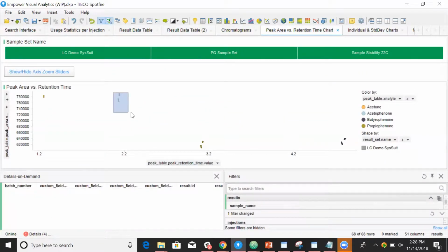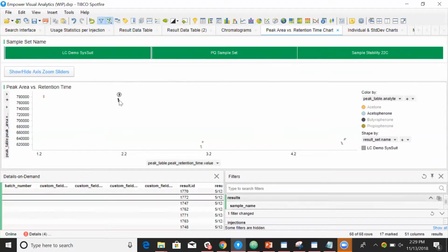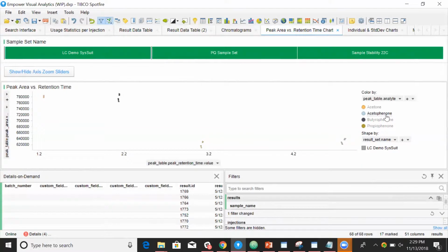We can see which results belong to which chromatogram, and can make selections here to display whatever we like. We can also organize by different metadata in order to improve the effectiveness of our visualization. Rearranging the chromatograms in a number of ways helps us compare different batches and different product runs.